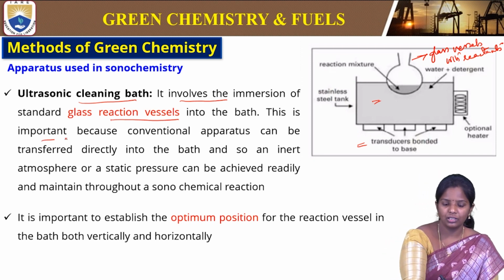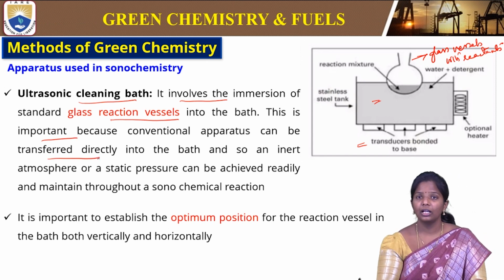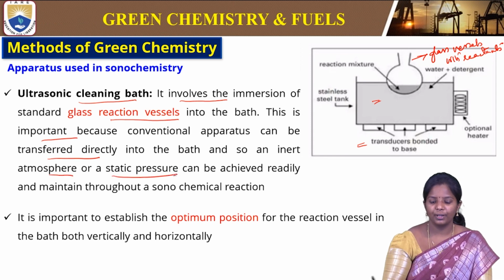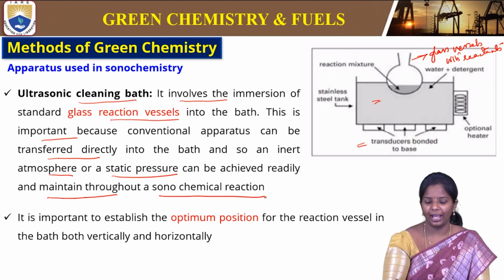This is important because conventional apparatus can be transferred directly into the bath. An inert atmosphere or static pressure can be achieved readily to maintain throughout this sonochemical reaction.